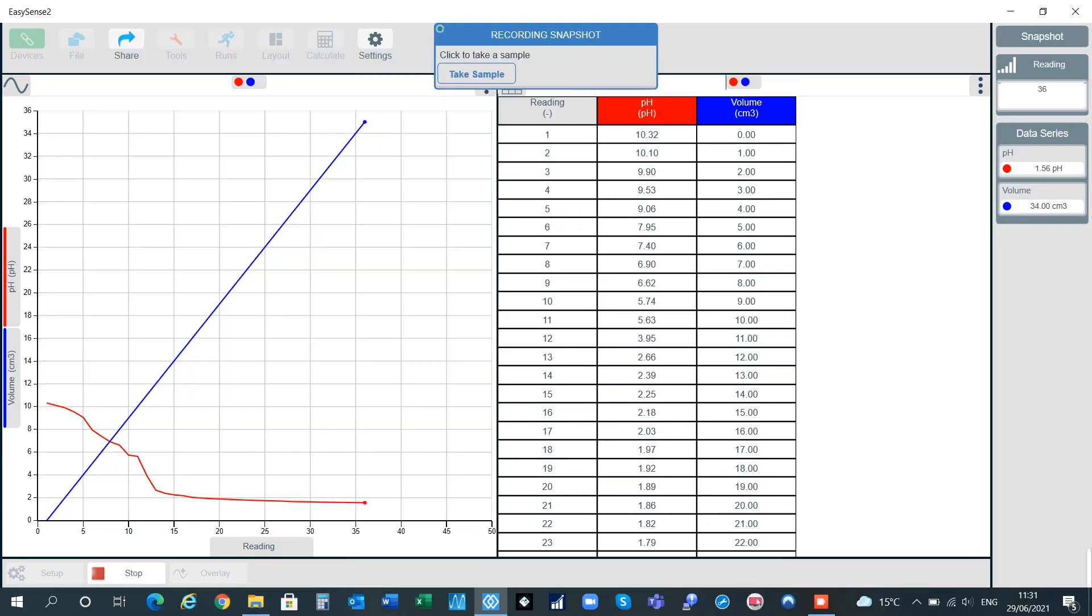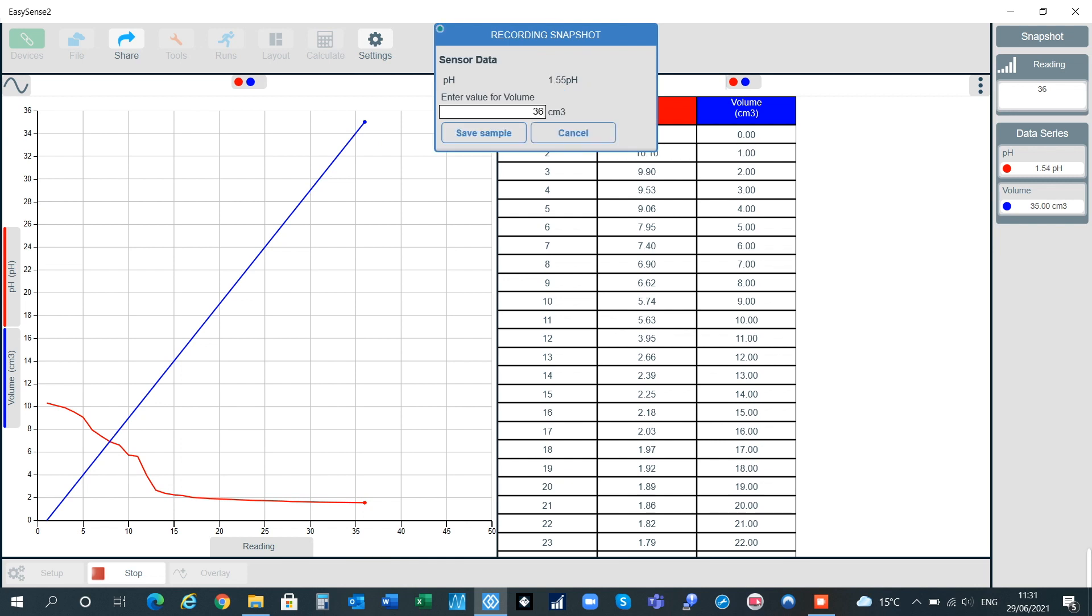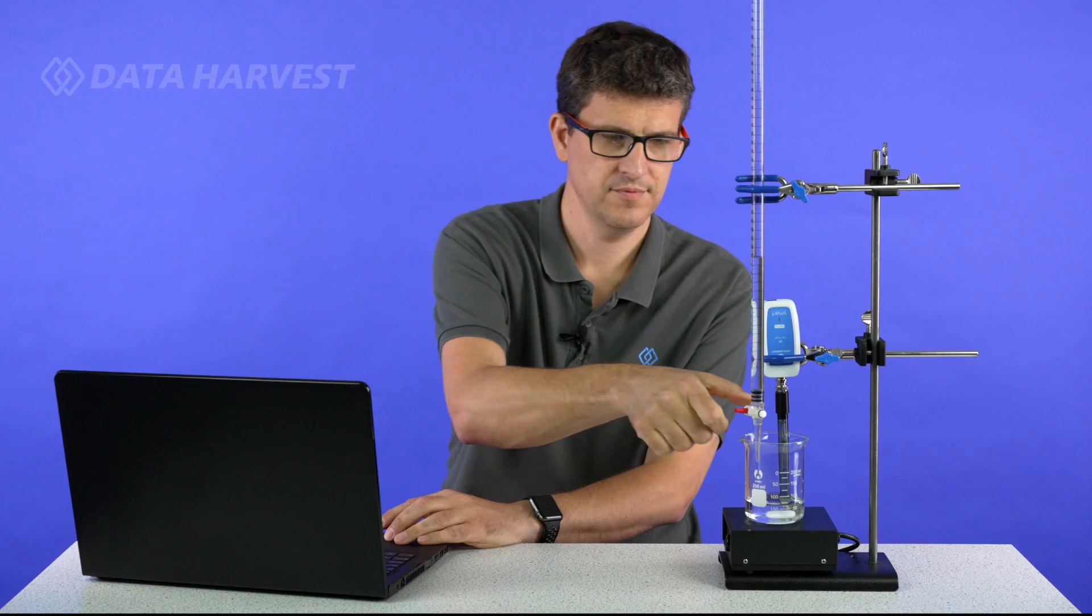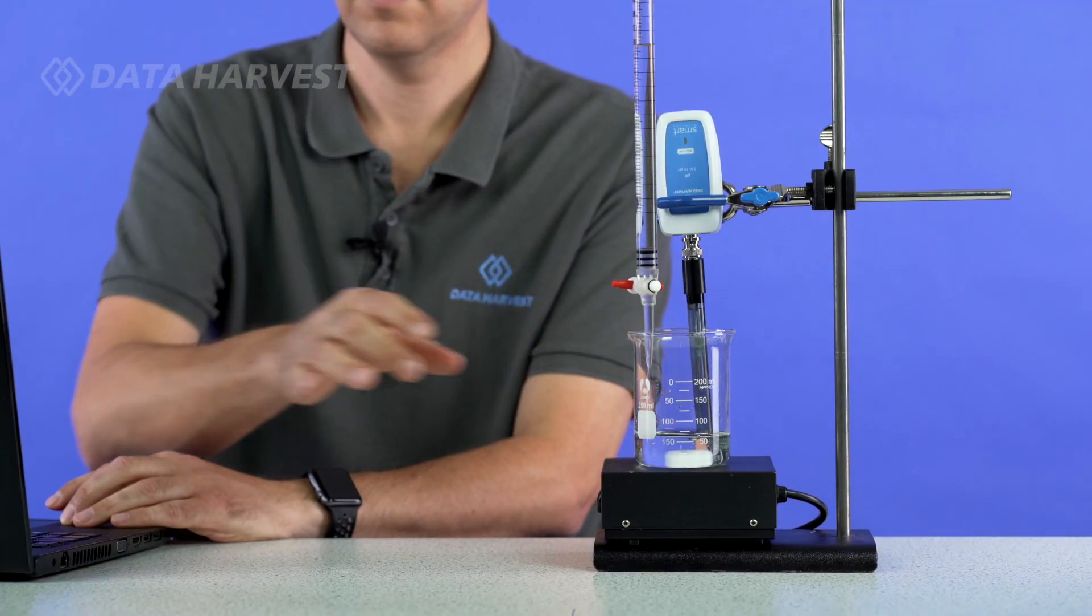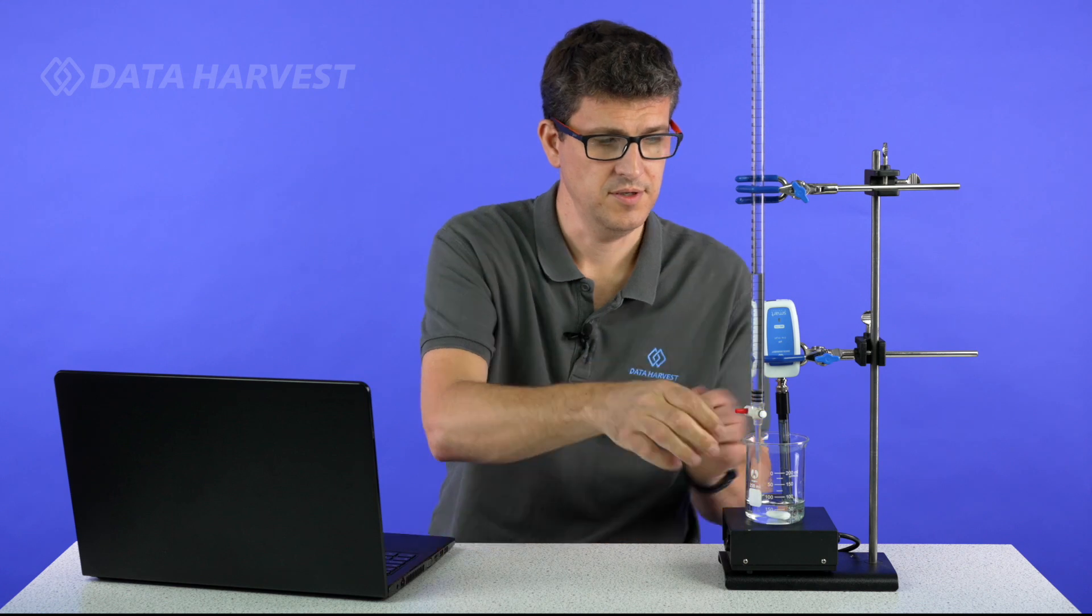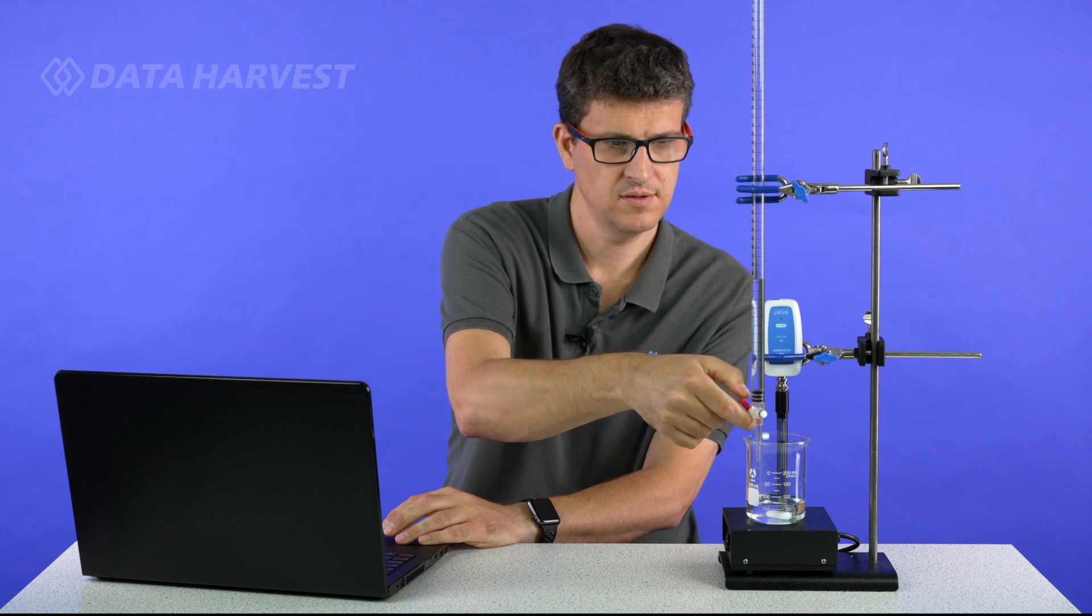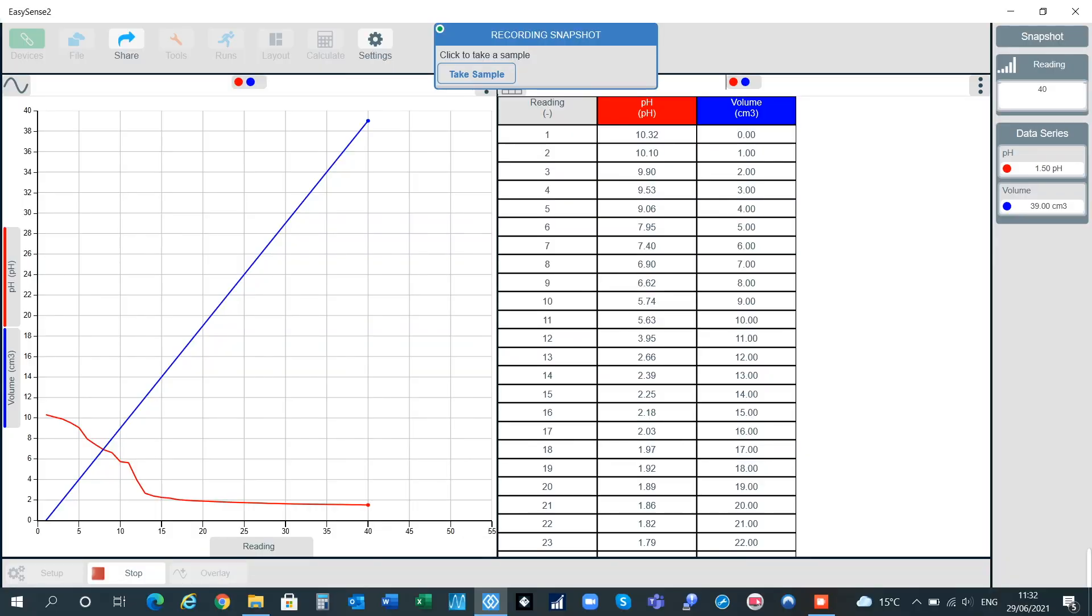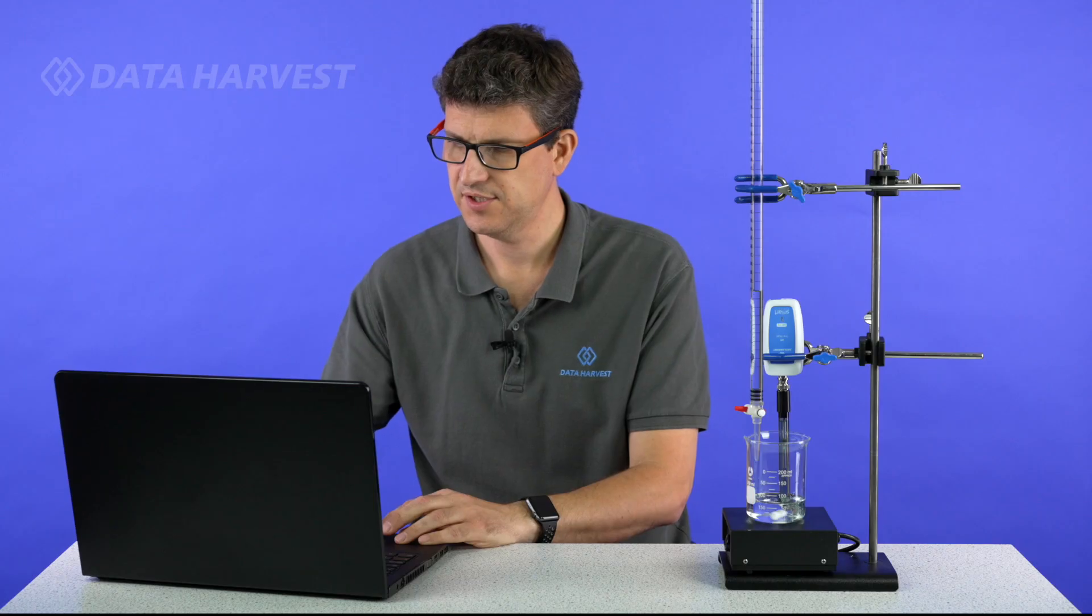36. 37. 38. 39. My magnetic stirrer was moved. There you go. So we're now up to 39. Up to 40. So it's bottoming out now nicely. So you can see that. I tend to carry on to the end, just so you can see it completely bottom out.